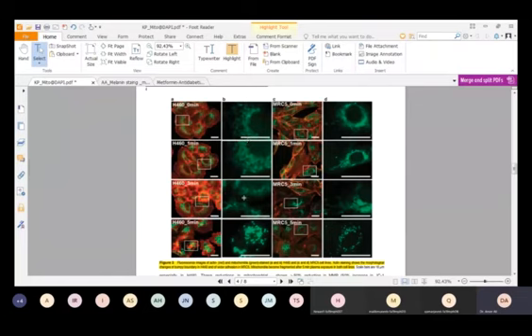And these images are for H460, and here we can see in the case of the healthy cell line, that is MRC5. If you look at the control sample, here also the mitochondria are arranged around the nucleus. Here in the middle is the nucleus. Here is the magnified form. This circle here is the arrangement of the mitochondria, and they look like tubular form, right? I mean, arranged around the nucleus. And in 1 minute, we have to some extent a similar arrangement of the mitochondria.